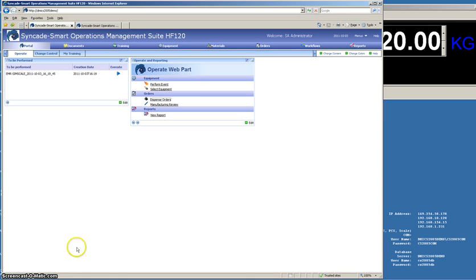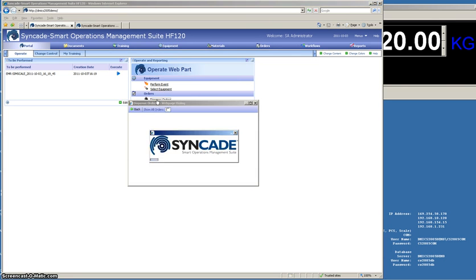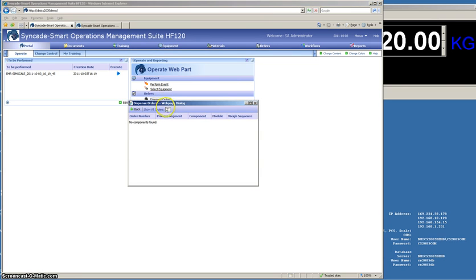So that's the process we're going to be looking at. I've already gone and created my order, and typically in a system like Syncade, it will be connected to the ERP, and so when the order is created in SAP or Oracle, it will be automatically downloaded to the system.